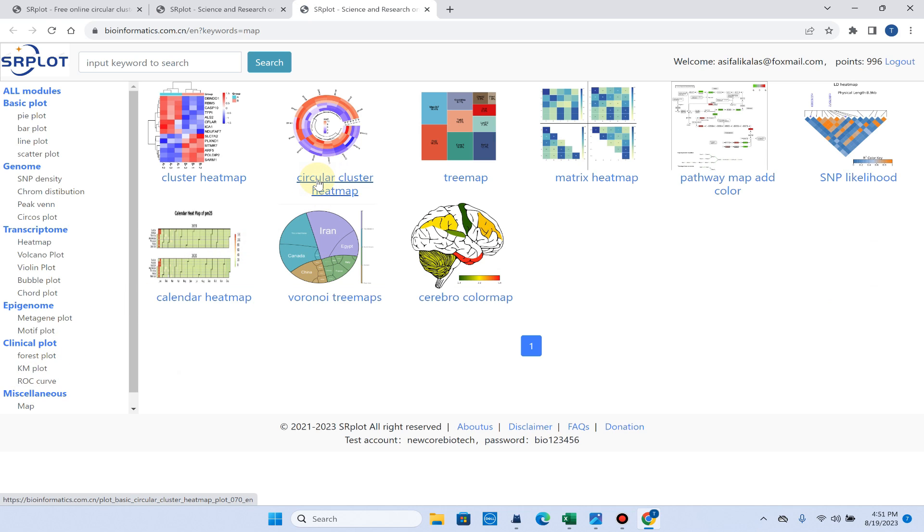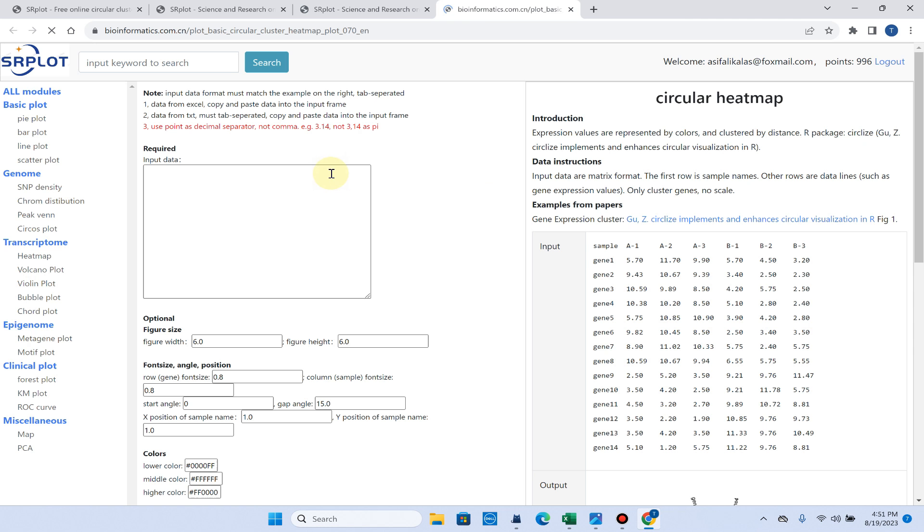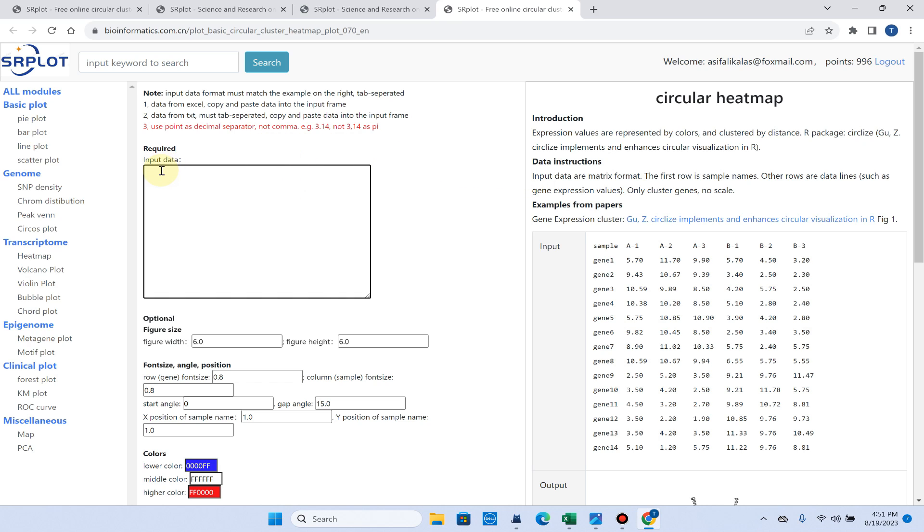On the second option here, you can see it is circular cluster heat map. Because we want to draw this, we will simply click on it and here you can see the next window shows that we can input our data.